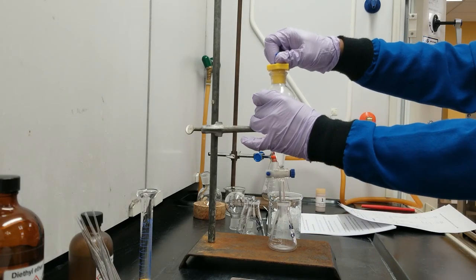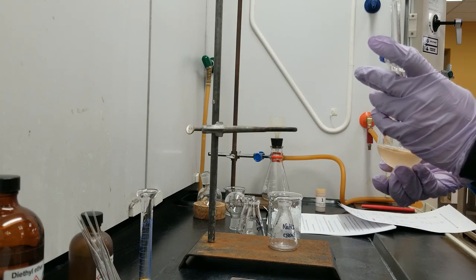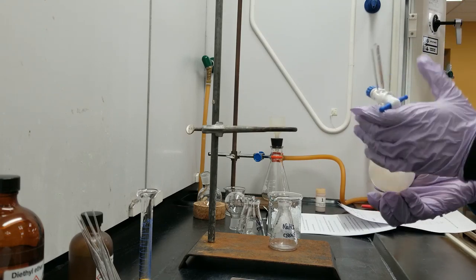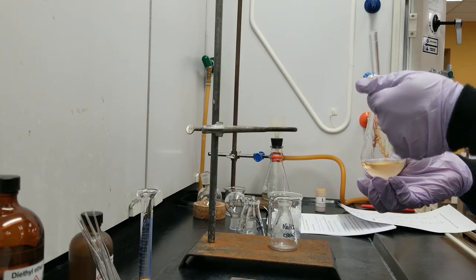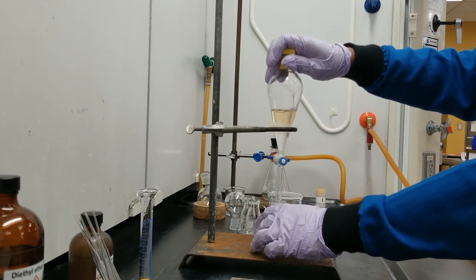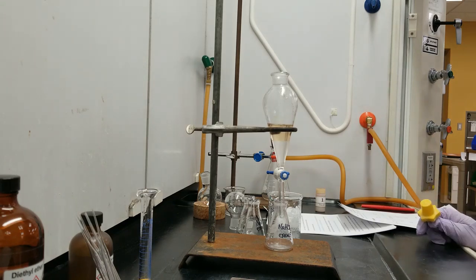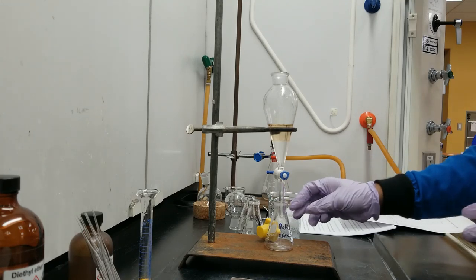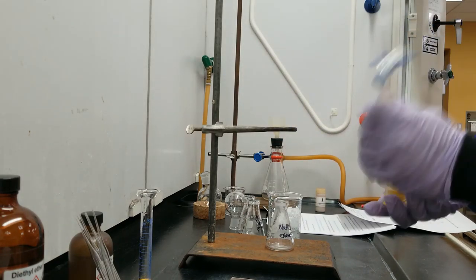The two layers are separated, so I am going to give it another shake and vent, and shake and vent, shake, vent, shake, vent. And now I rest it, take the lid off, avoid the pressure buildup. Three is the magic number in chemistry, so probably I will do the same thing one last time.